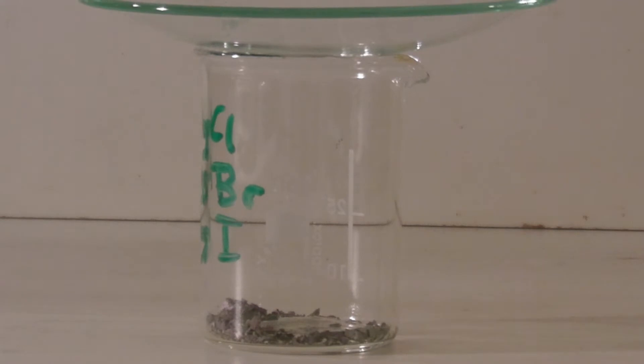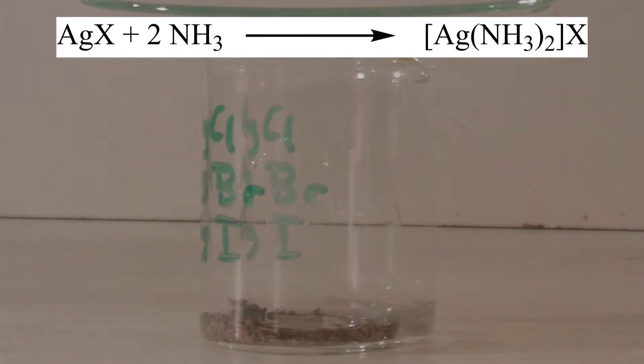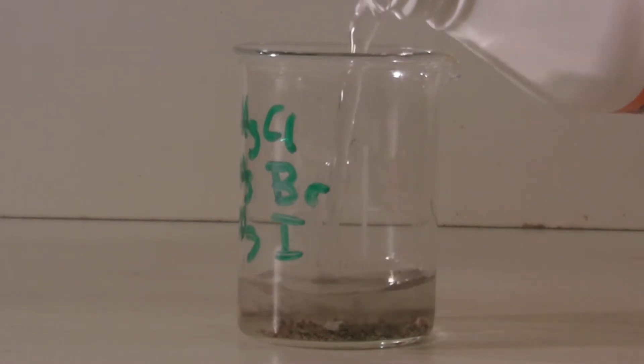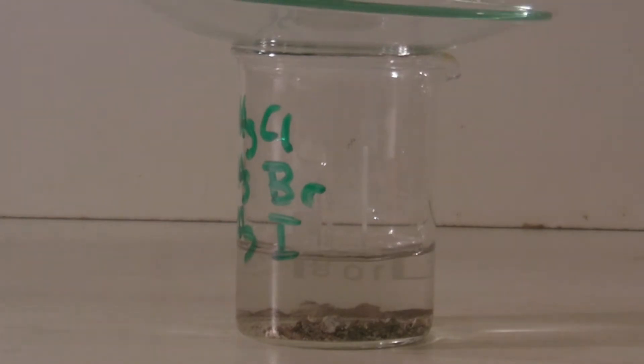First, the beaker was covered and then concentrated ammonia was added with a pipette. Silver chloride and bromide do form a diamine-silver complex in concentrated ammonia, which is soluble. Silver iodide doesn't form this complex. At the end, a large amount of ammonia was added because only a small part of the salts contained the iodide and most of it should have dissolved.